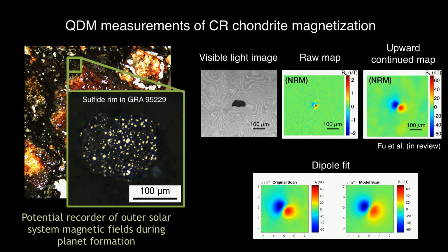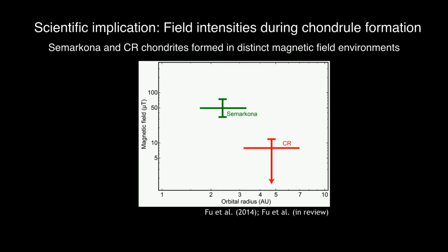Where's that paper going? It's in review, at JGR Planets. We didn't get a lower bound; this is just an upper bound. We basically found there's no signal, and then we used ARMs to quantify the recording limit. If we had a lower bound, I would maybe take a bigger bite out of things. I think it's consistent with what we see, but I wouldn't say it's game changing. But I think it's still a cool result. It's the first result from the outer solar system chondrites.